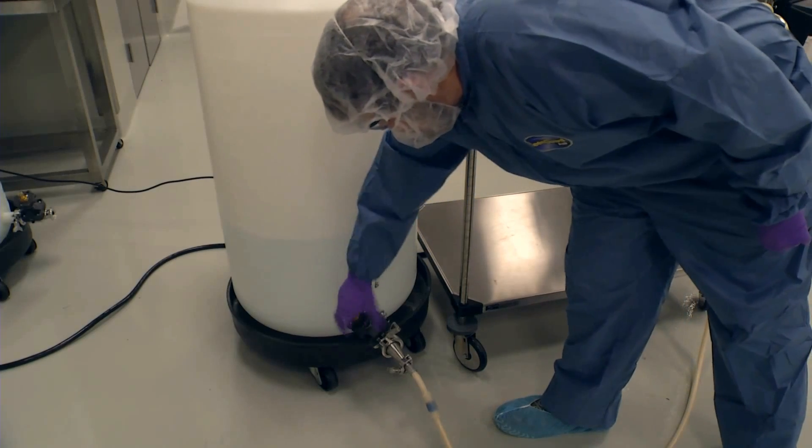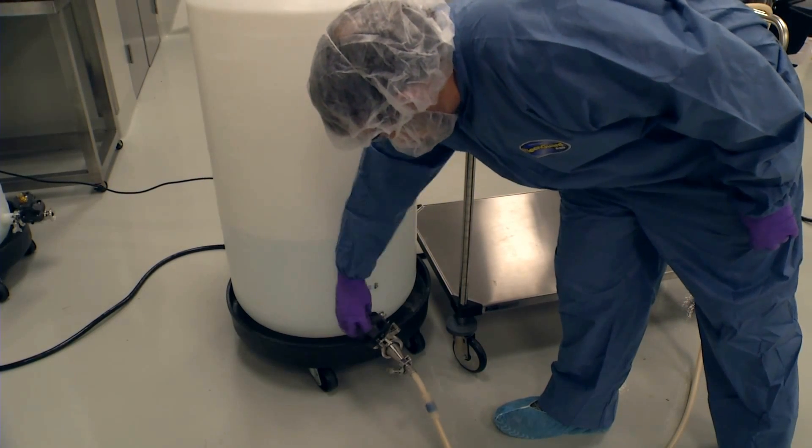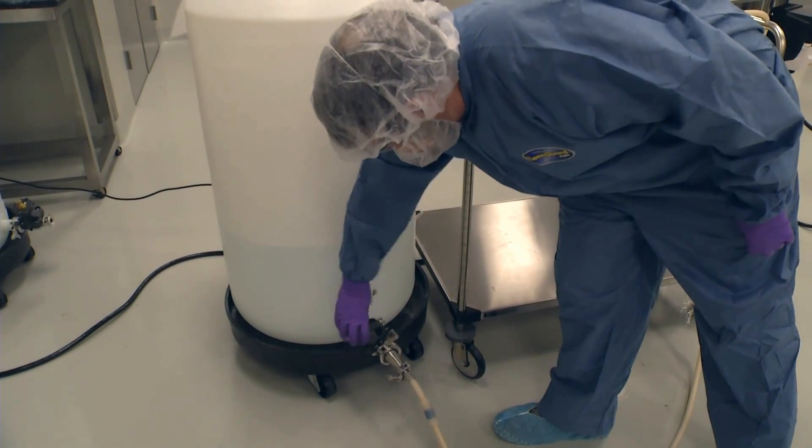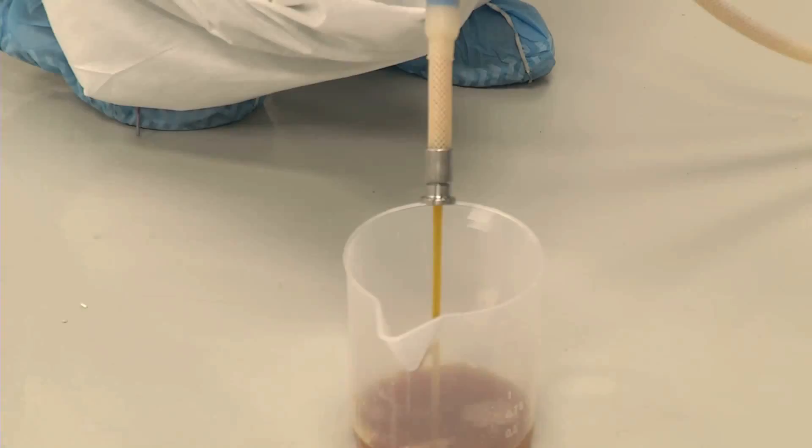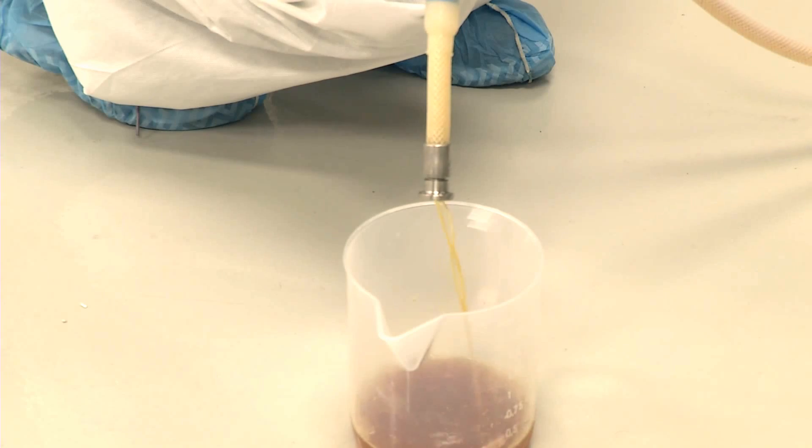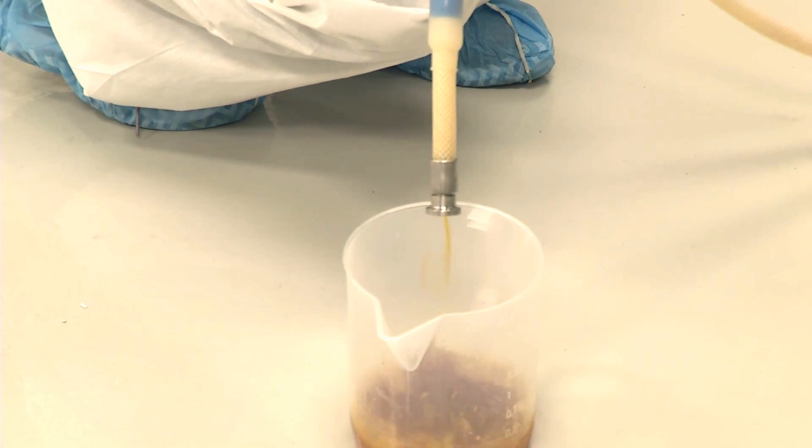The cell paste is suspended in a buffered solution and then run through the centrifuge again. As the clarified liquid leaves the centrifuge this time, it carries many of the contaminants from the fermentation step with it.